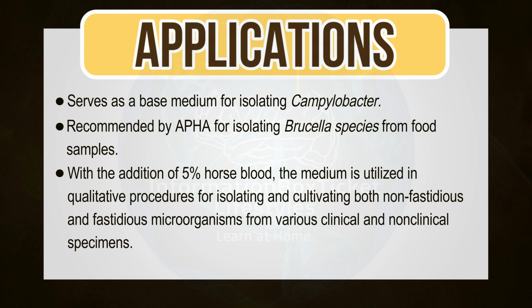With the addition of 5% horse blood, the medium is utilized in qualitative procedures for isolating and cultivating both non-fastidious and fastidious microorganisms from various clinical and non-clinical specimens.